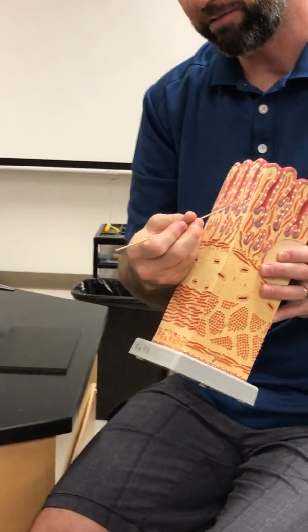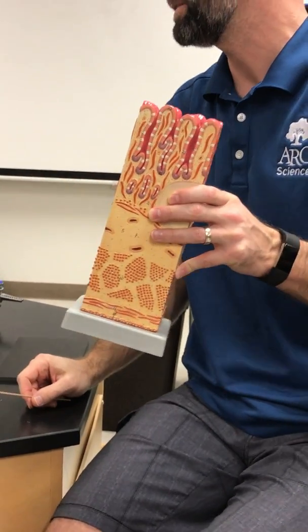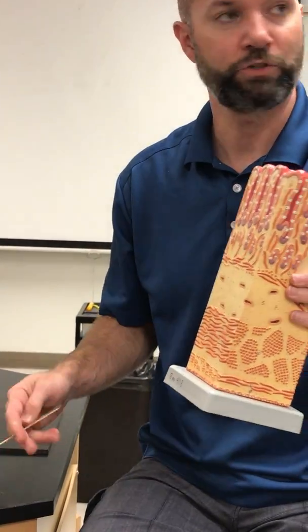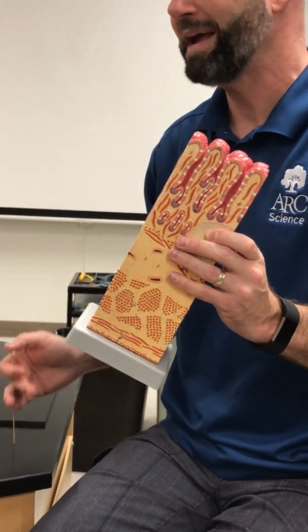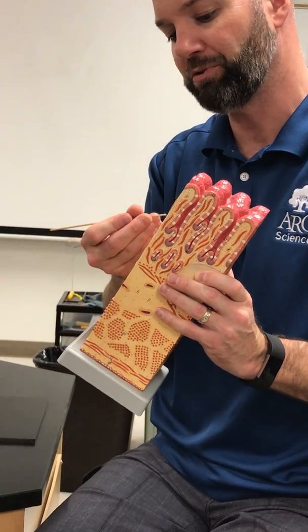How about the cells at the very bottom? Chief cells? That's the wrong organ. It's a small intestine. No chief cells. No parietal, that's all stomach. Paneth cells or enteroendocrine cells. Both are found at the bottom.